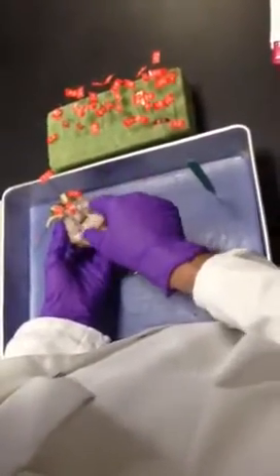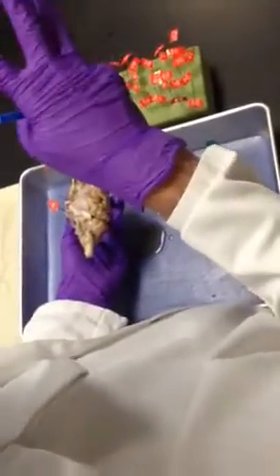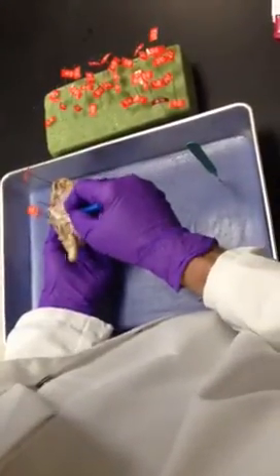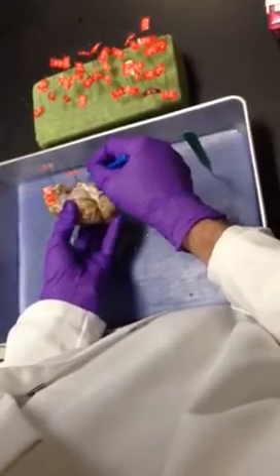And then adjacent to your pituitary, remember the cranial nerve I said that's huge on the sheep, and it's got 3 branches? Trigeminal. So this is trigeminal. It's coming out here. So there's one branch there, one there, one there.